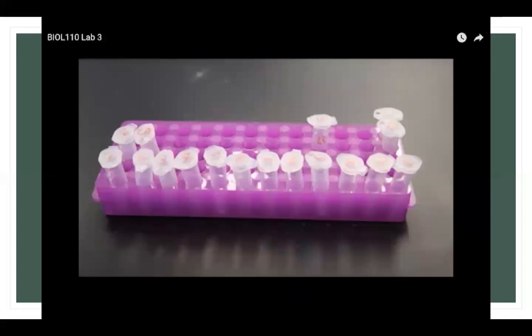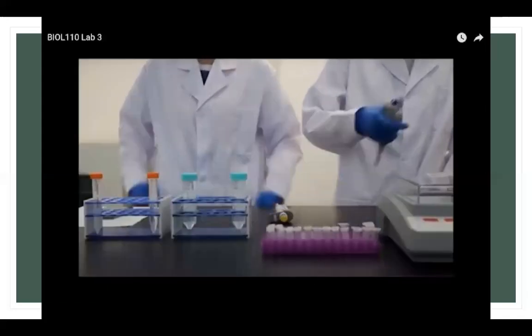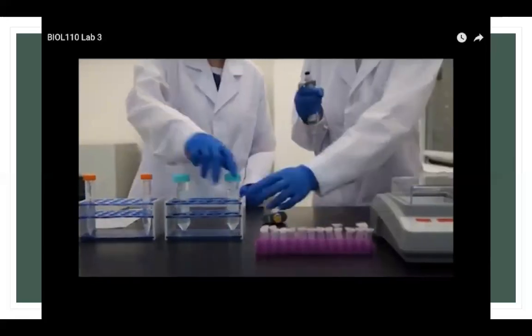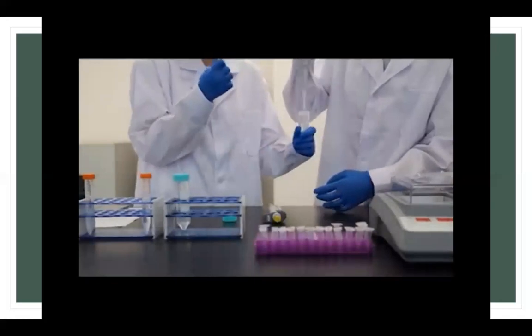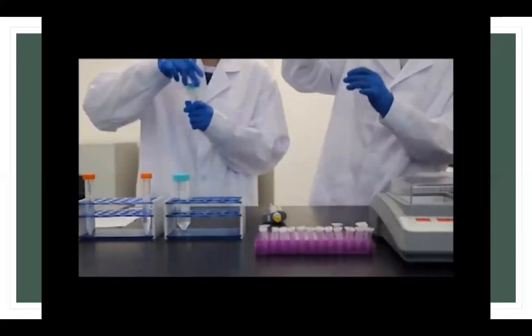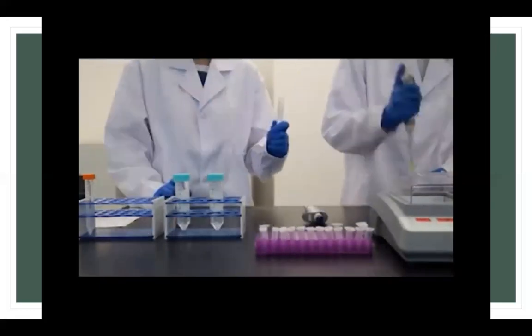Here is the tube containing 1 milliliter of supernatant solution, and the experimental design is shown in the table, including 2 control groups and 4 test groups, which ended at 30, 60, 90, and 120 respectively. For each test group, we use 3 tubes to do 3 repetitions of the experiment. Here are the steps to conduct these experiment groups.